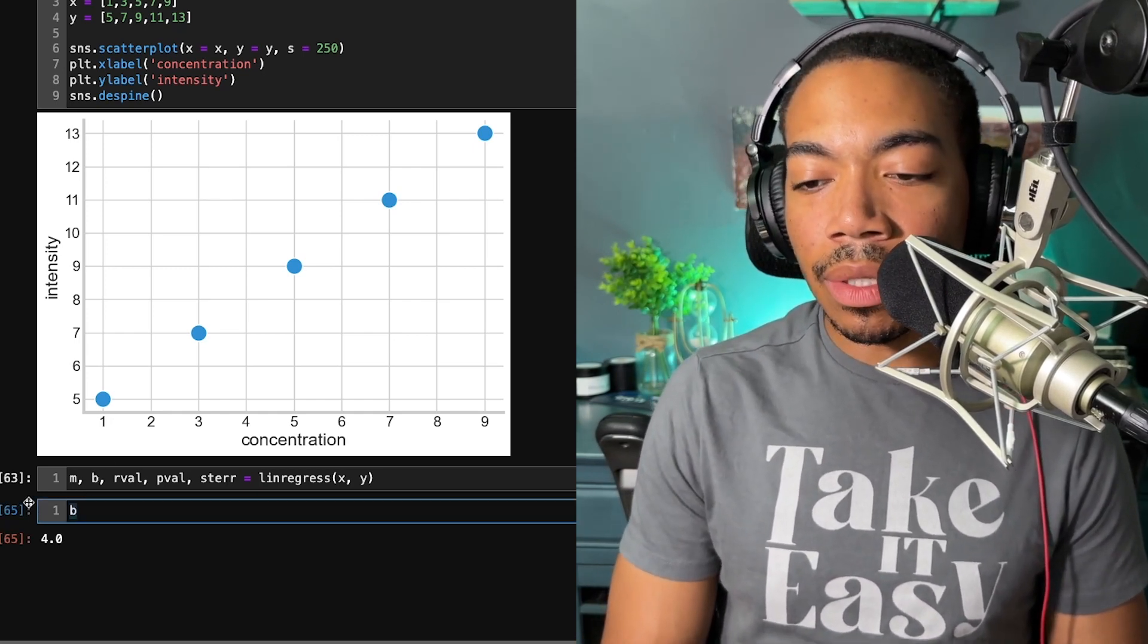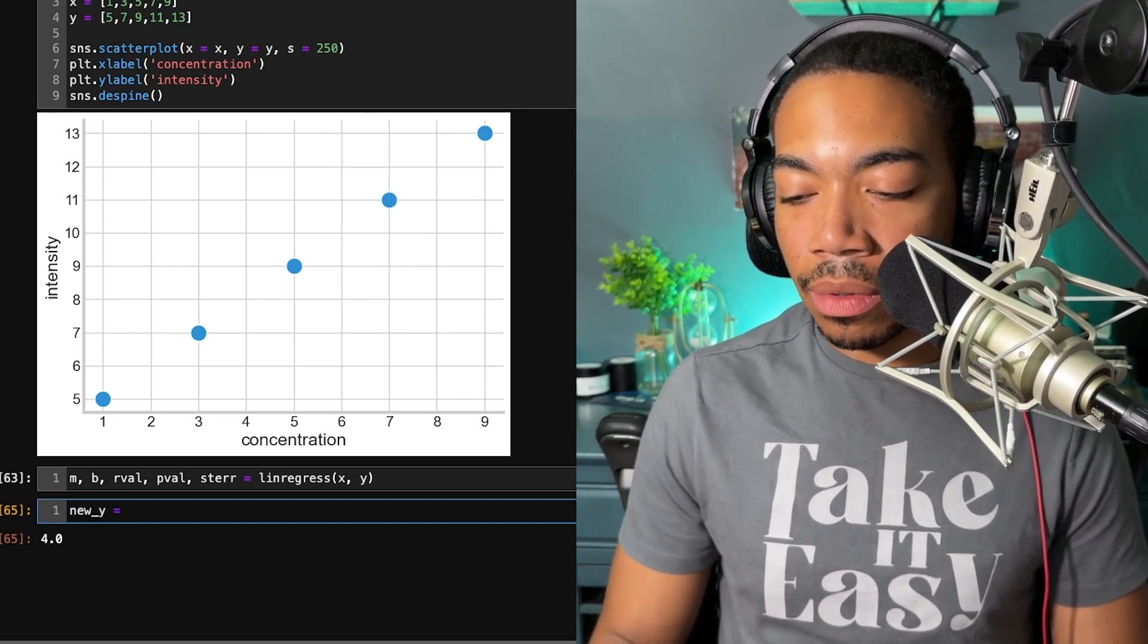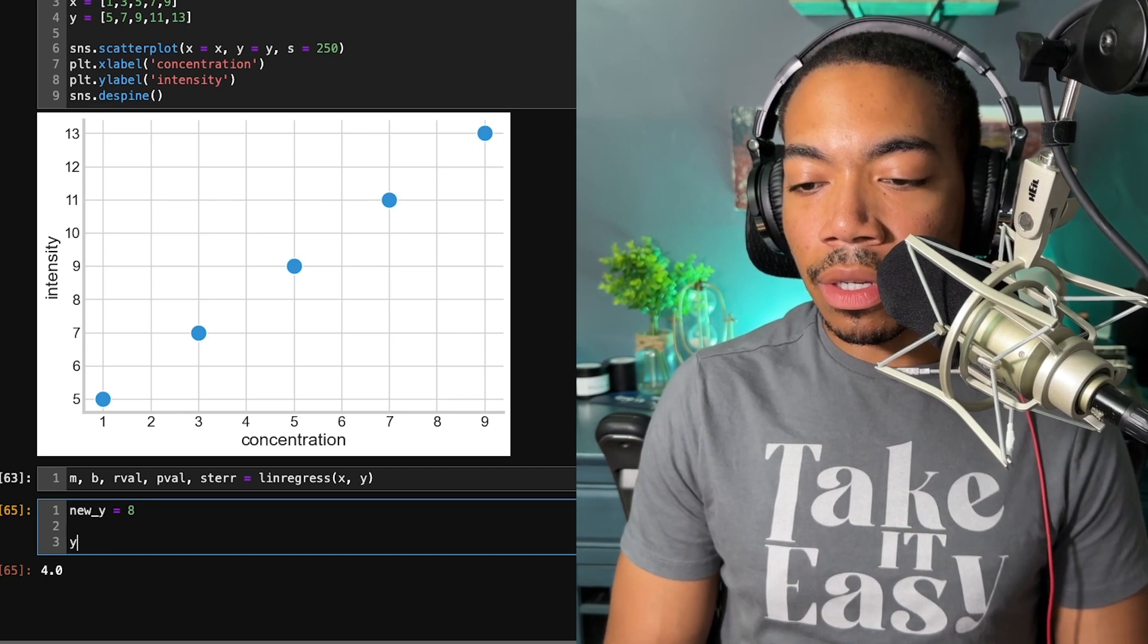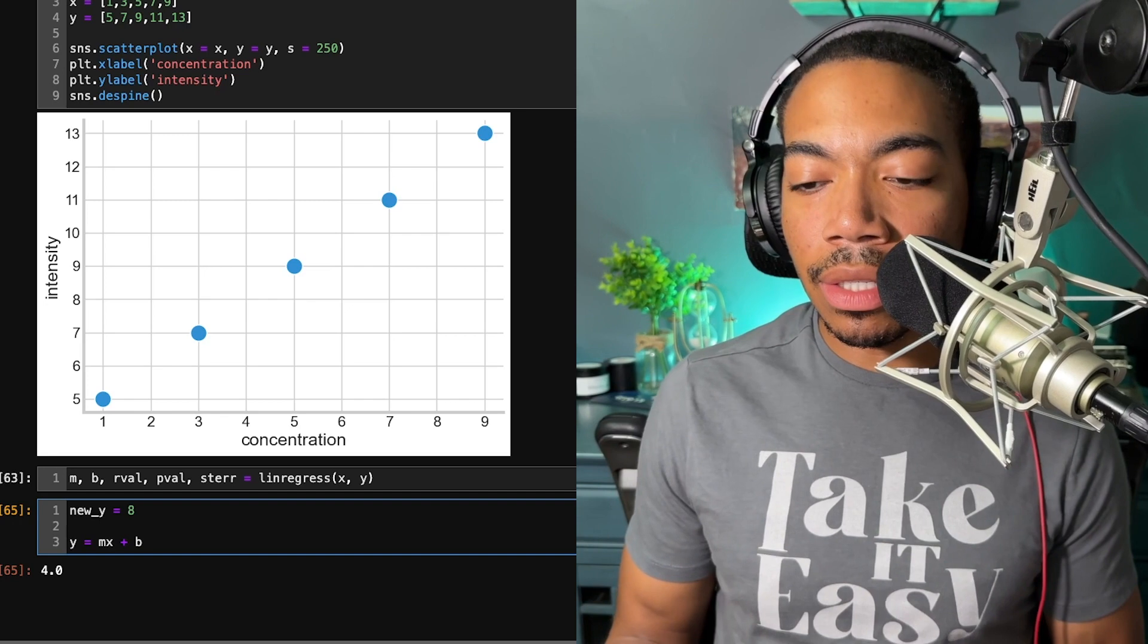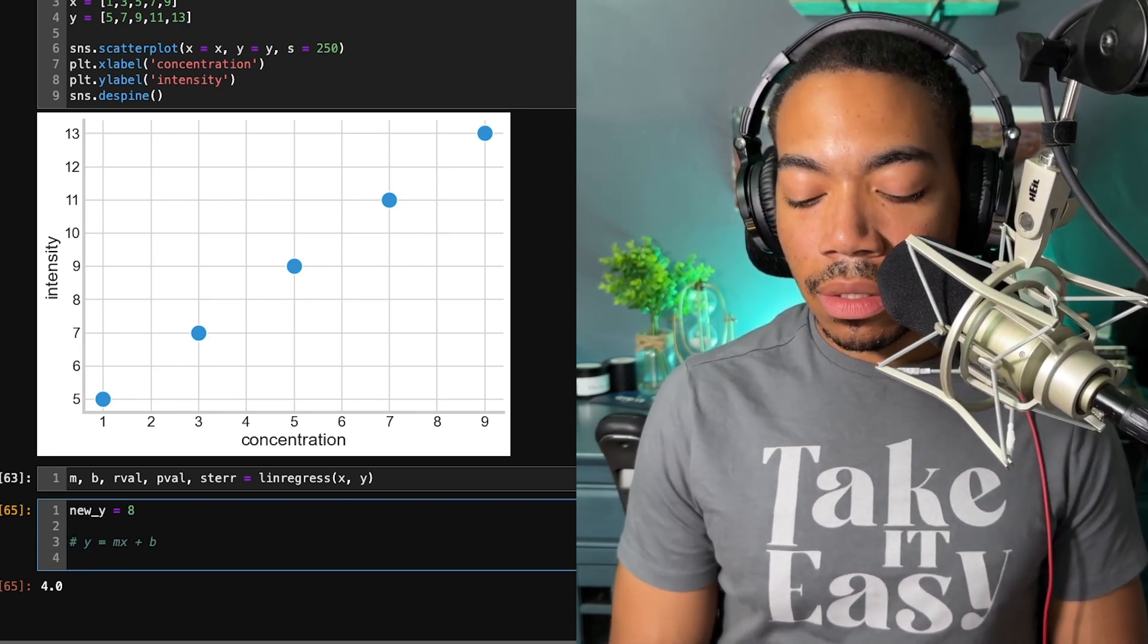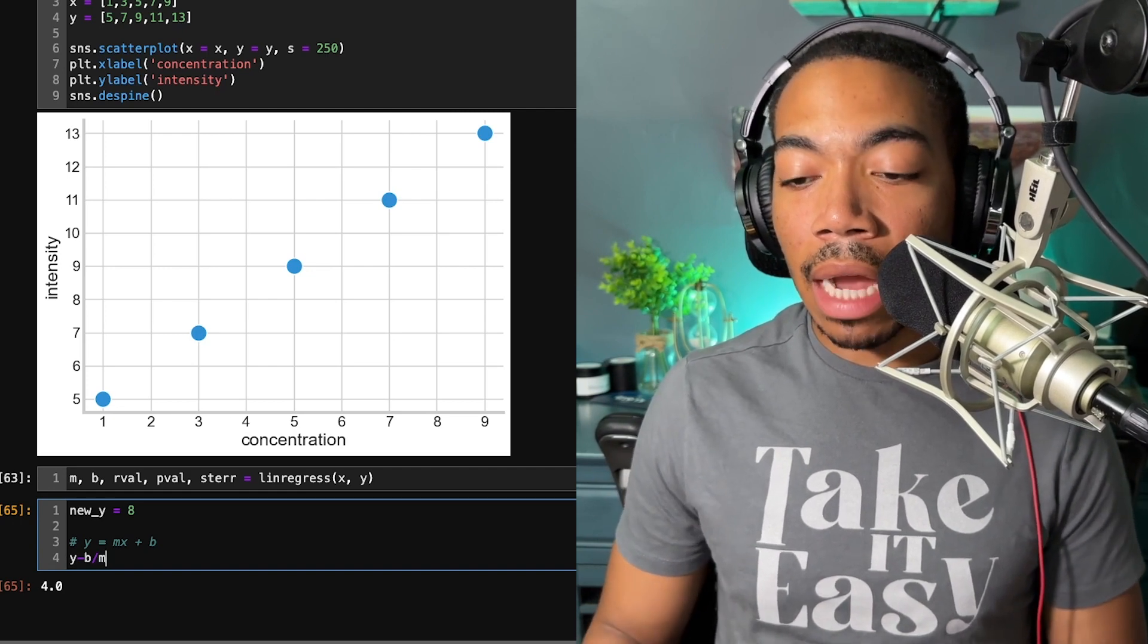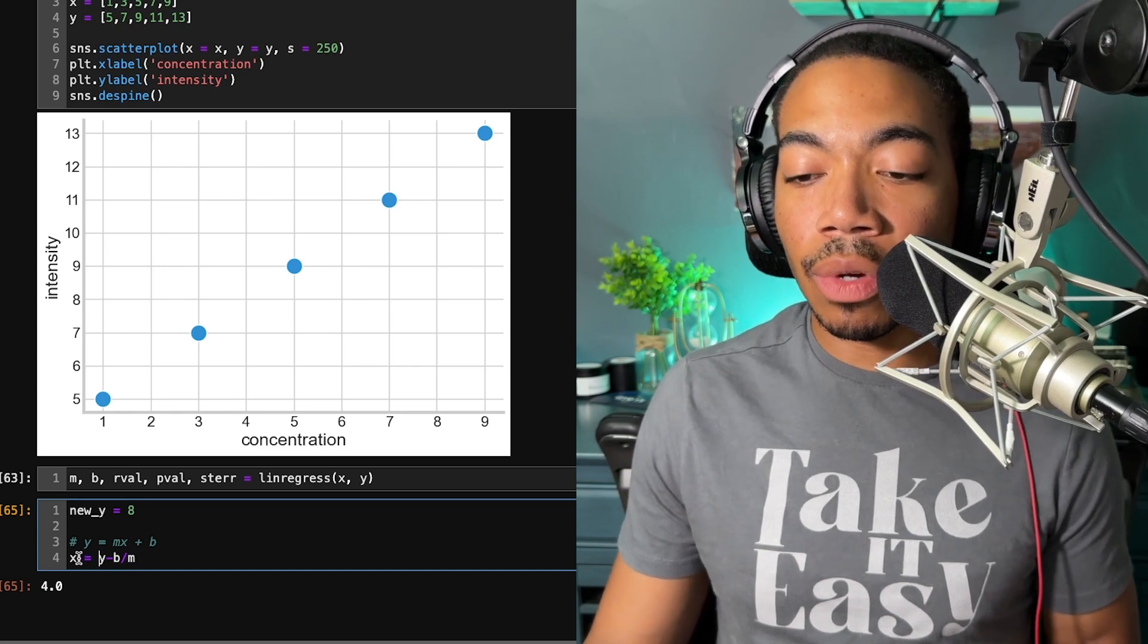To demonstrate what we want to do, let's say we have a new y value that equals 8. And we know that we have our original equation y equals mx plus b, but now we want to rearrange this equation so that we can solve for x. To do this, we will take y minus b and then divide by m. And this becomes our new equation, which equals our x value, the concentration we're trying to predict.